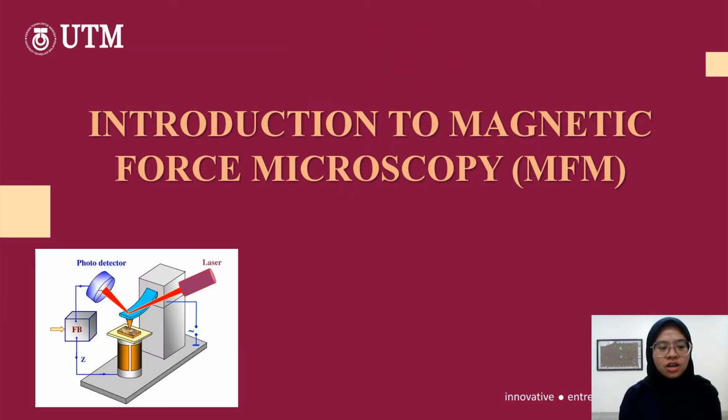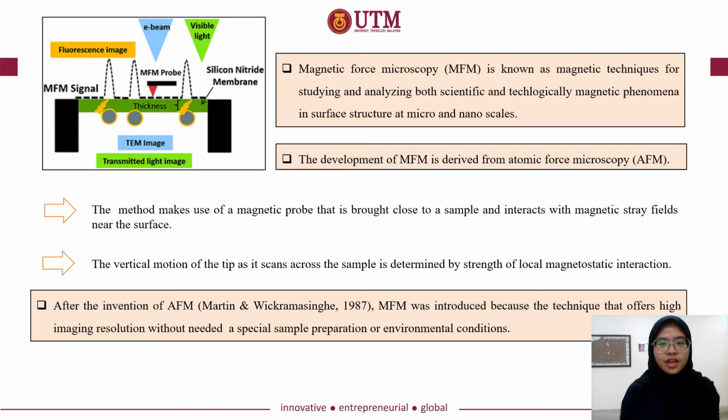Now let's focus on the slide of introduction to magnetic force microscopy, which is known as MFM. First of all, what is magnetic force microscopy? Magnetic force microscopy is a magnetic technique for studying and analyzing both scientific and technologically magnetic phenomena in surface structure at micro and nano scales. Bear in mind that the development of MFM is derived from atomic force microscopy, which is known as AFM.